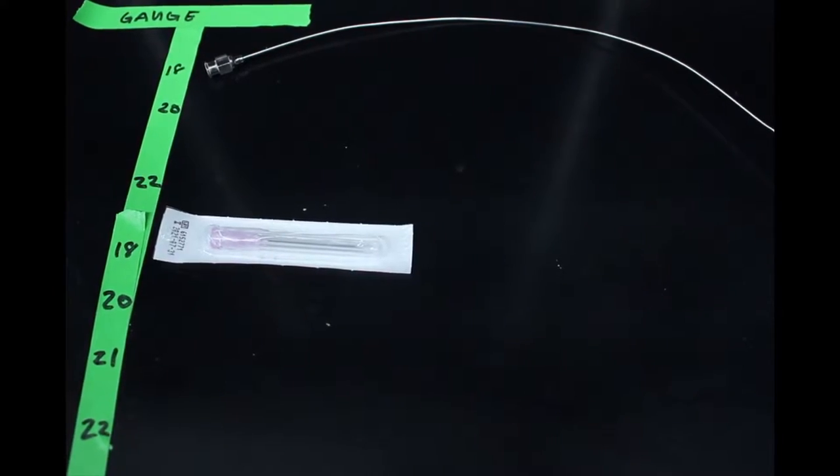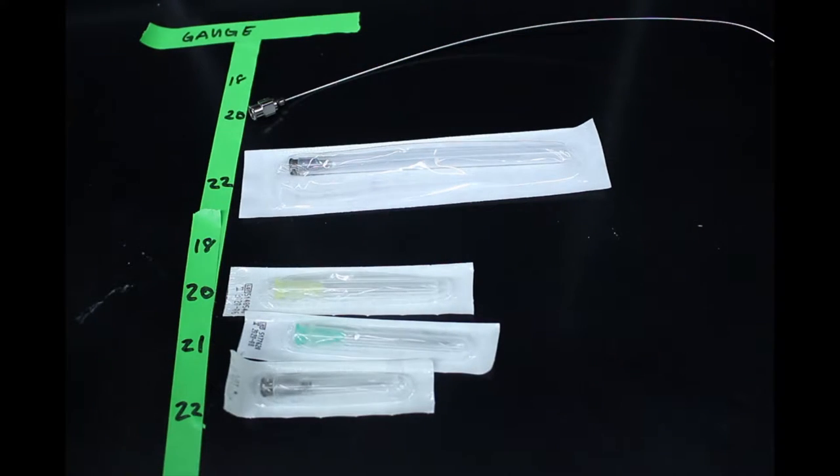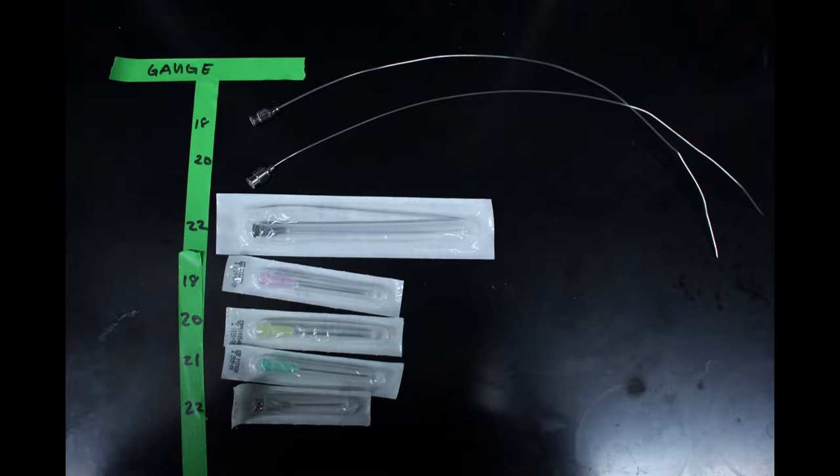Typically, smaller gauge needles are used for solvents and viscous reagents and thinner needles for reagents. Disposable needles are used for reagents that may clog the needle making it difficult to be cleaned.